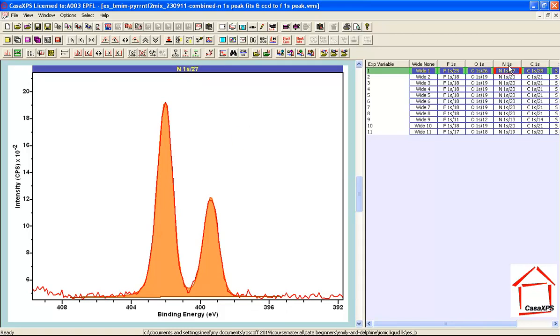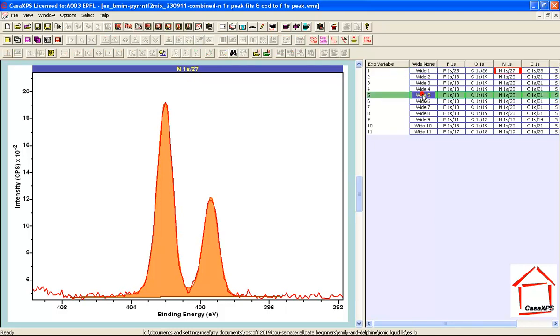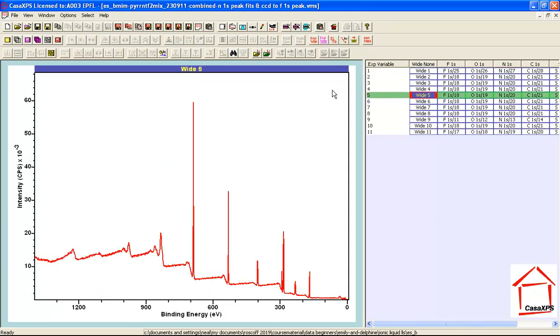What I need to do is to display a single survey spectrum rather than having a scroll list and I can do this by double clicking on one of these survey VAMAS blocks. So wide 5 when I double click it appears as a single tile no scroll list because it's the only one that was selected.